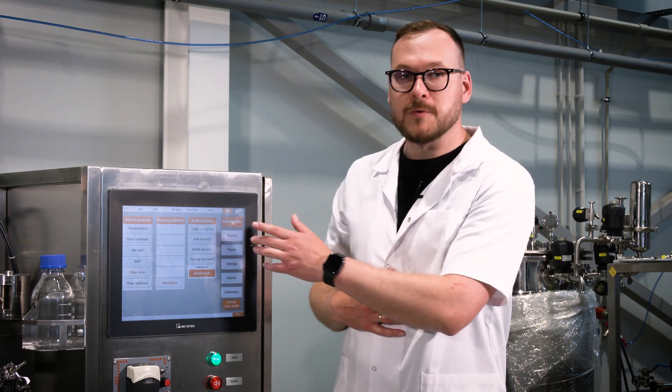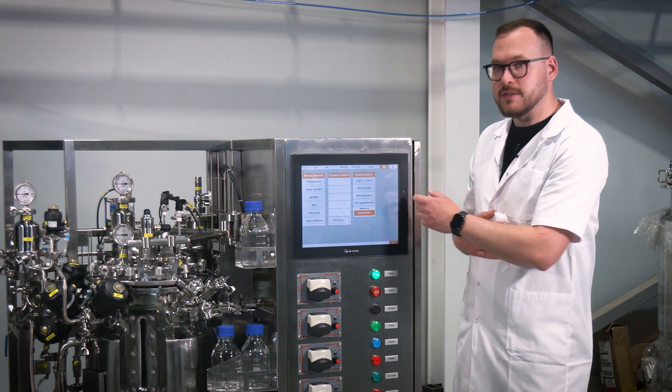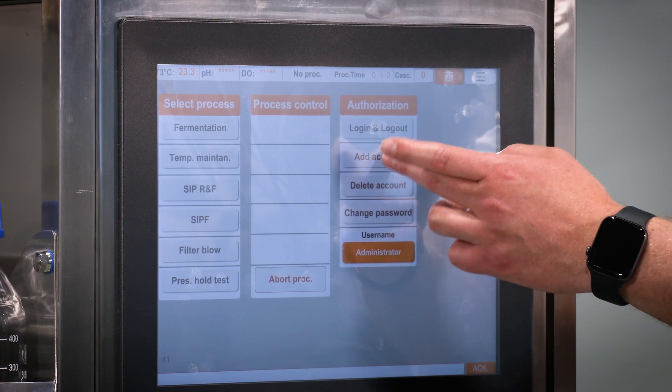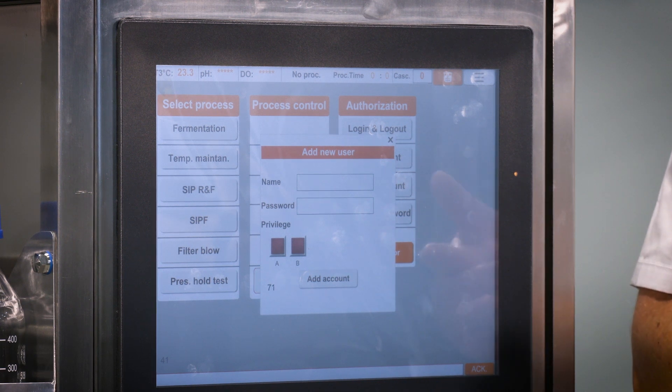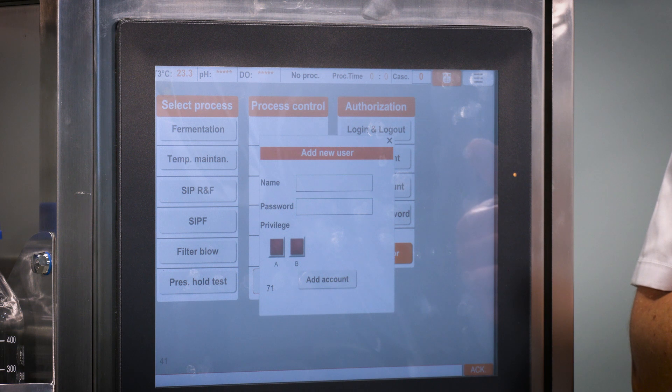In the administration window at the administration level you can perform the following actions. Create new users by pressing the add account button and a pop-up window will appear.